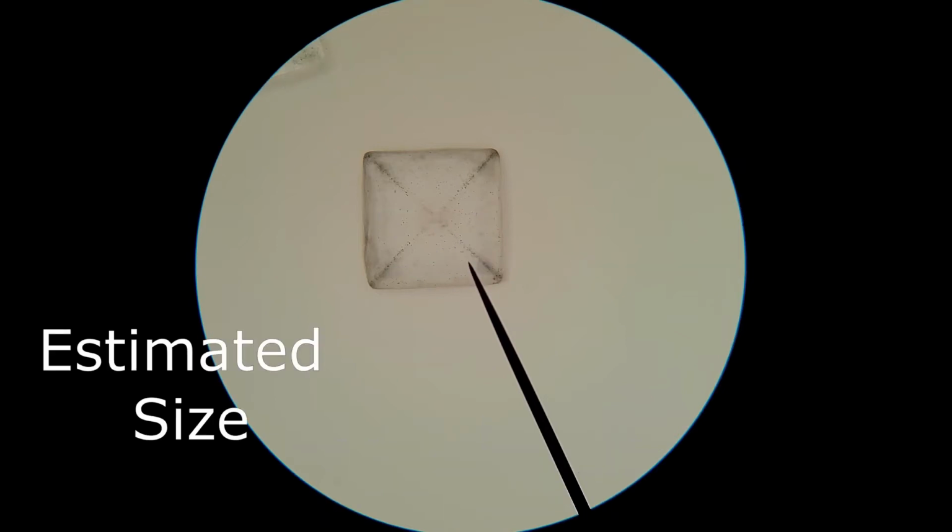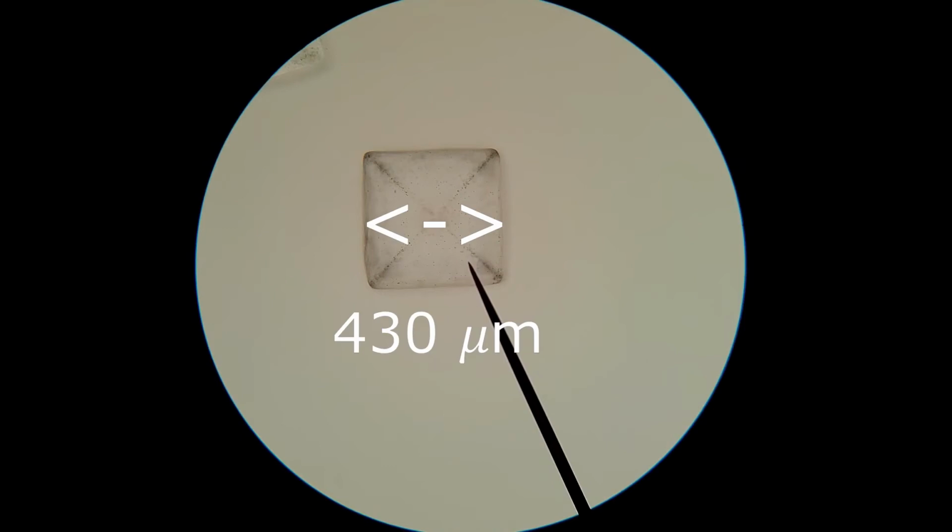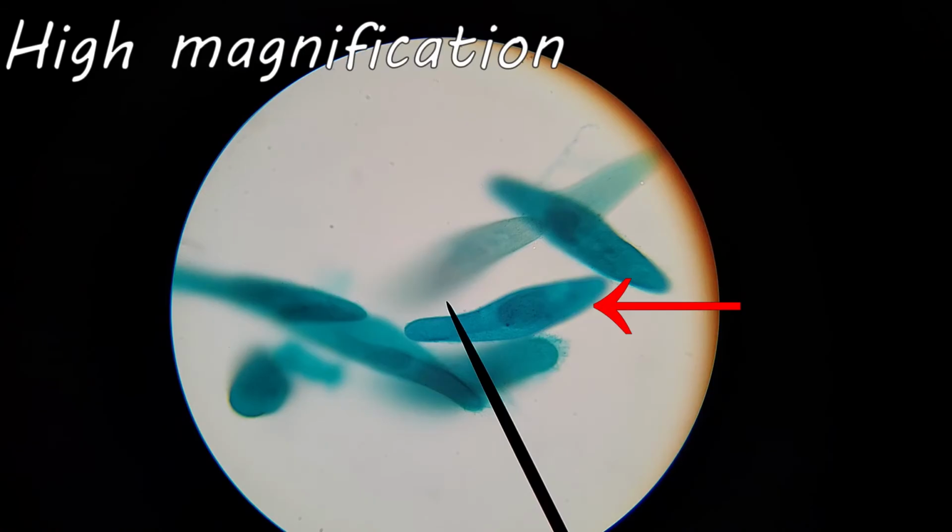That means we can estimate the size of our salt crystal by taking our field diameter, which is 1,720 micrometers, and dividing it by our fit number, which is 4. We should get an estimated size of about 430 micrometers. That means we've estimated the size of this salt crystal to be about 430 micrometers wide.